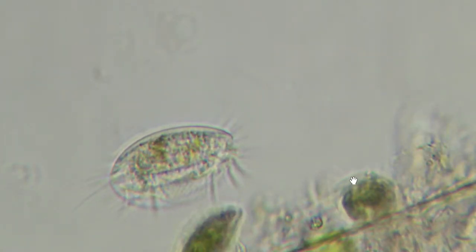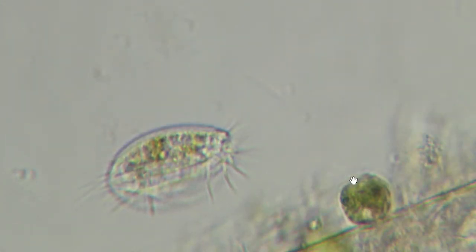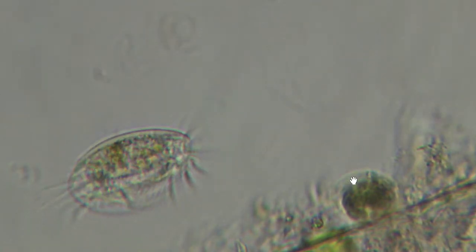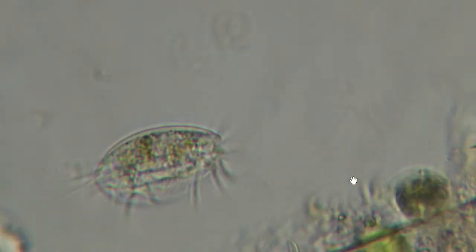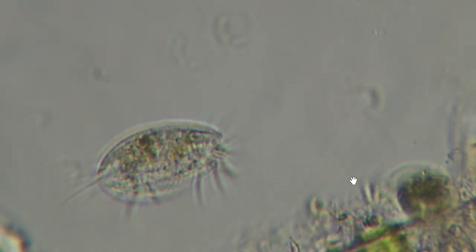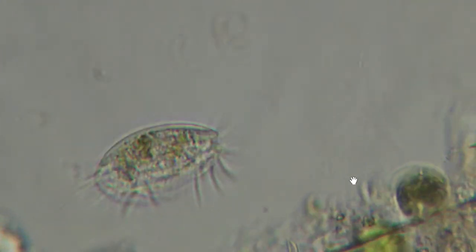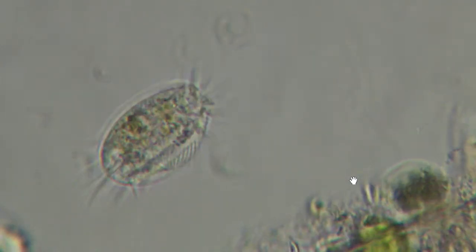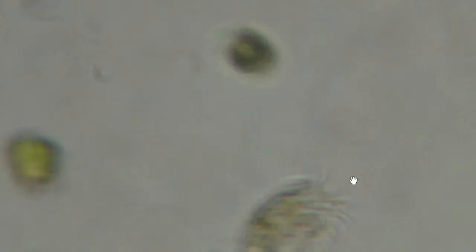See the cirri, they just kind of move around like little legs. They're not beating constantly like cilia do. They're very purposeful. The body of the cilia are going to town, but the cirri are fairly rigid. Okay, it's not walking yet.